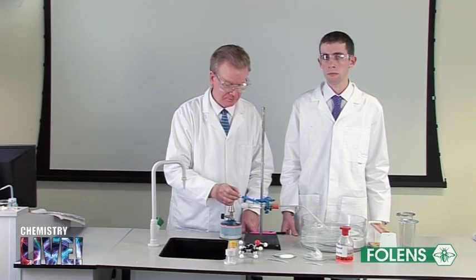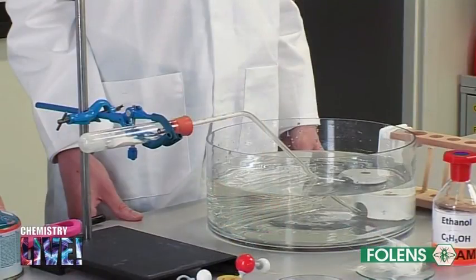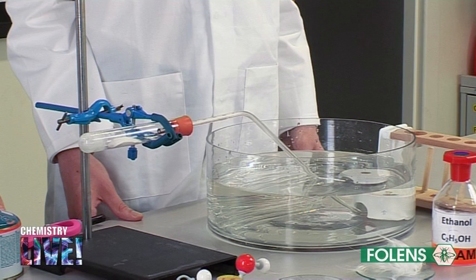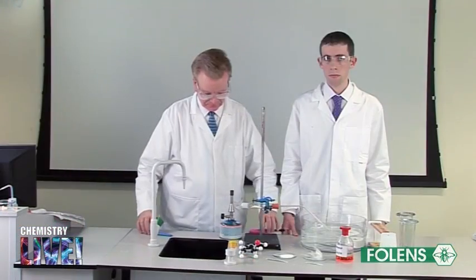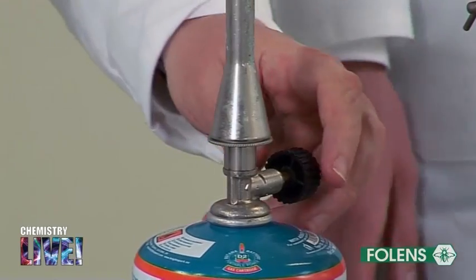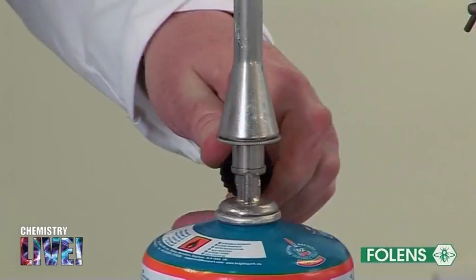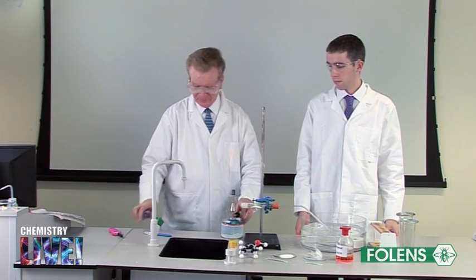The apparatus to collect the ethene gas is set up as shown and the gas is collected over water. Light the Bunsen burner, adjust it to give a blue flame, and gently heat the aluminium oxide.